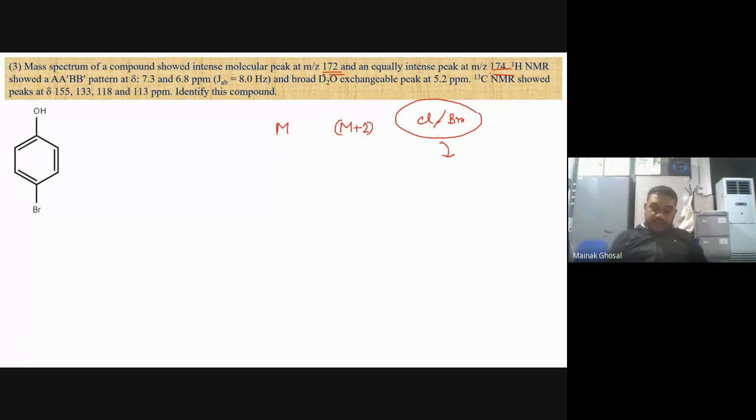Now, whenever you are not given any information about whether chlorine or bromine is present in the molecule, how do you know from the mass data that chlorine is present or bromine is present? I have written here bromine present. How do I know?